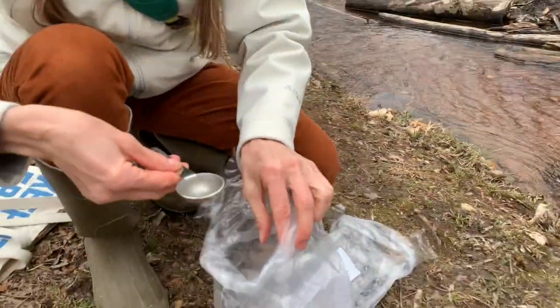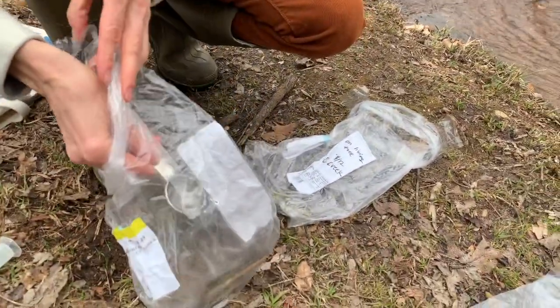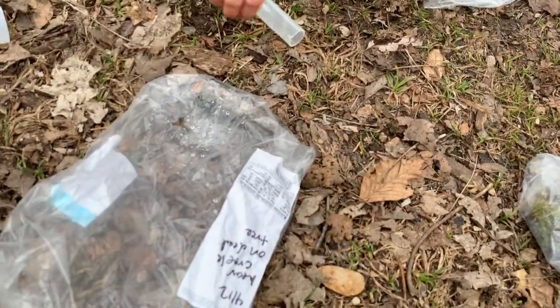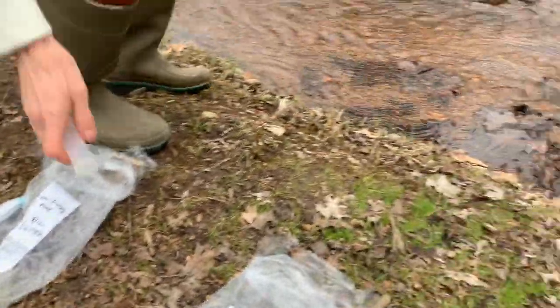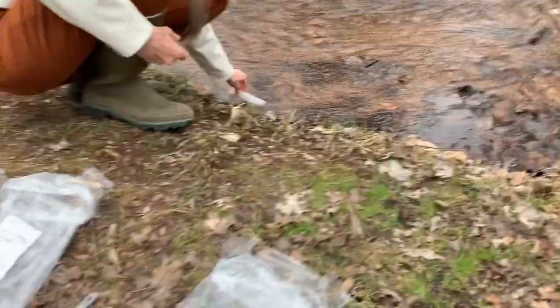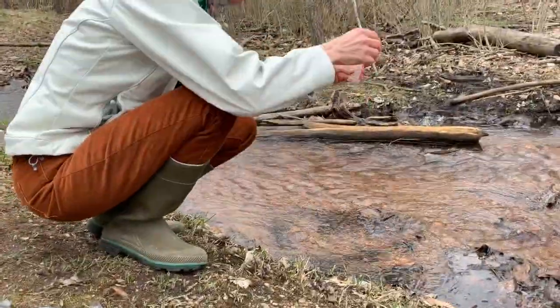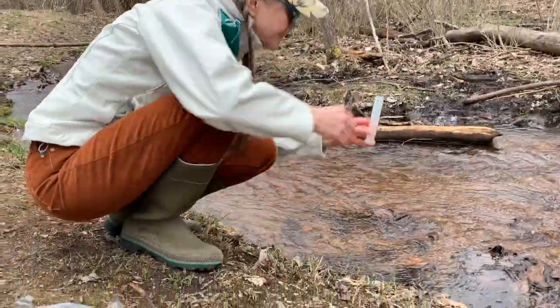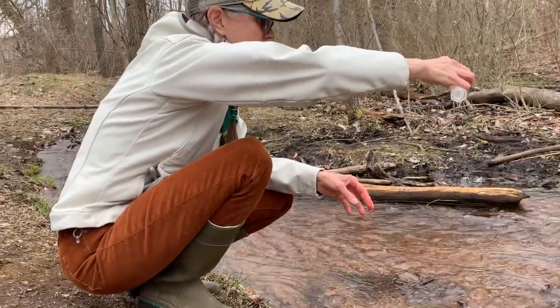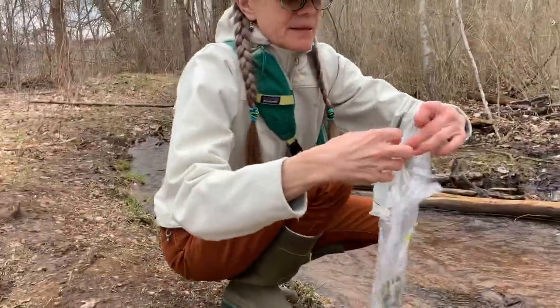And I'm going to add this to the bag, and I want to just make sure I get it on each sample. And I'm going to get another 10 milliliters here. And just get a little close to that. Doesn't have to be exact, like I said.